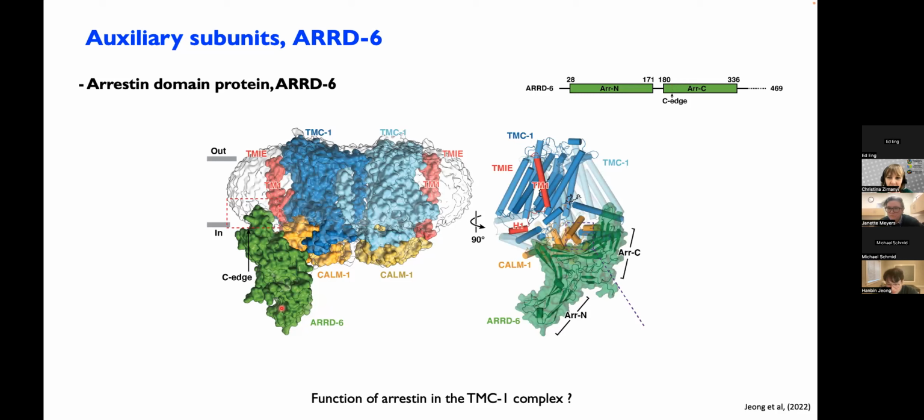The mass spec? Yeah, they asked, have you seen particles with both sides occupied, and if the mass spec suggested that there was a conformation with 2 copies? Oh, yeah, I think we didn't find out the stoichiometry of each protein on mass spec. Okay.